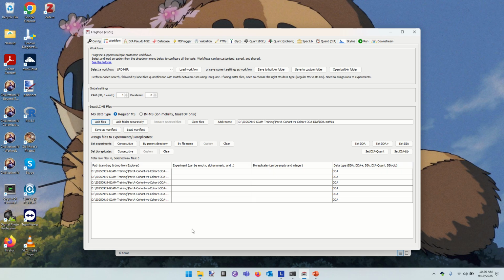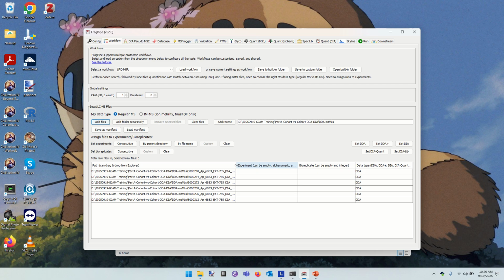Now you can see it's already truncating the file names because that column is not quite wide enough. Let me pull this a little wider because it's going to tell me which files belong where. Okay, it's way over there, isn't it? So the path is already quite long. And then over to the right, I can now see ratio 0:1, ratio 10, and so on.